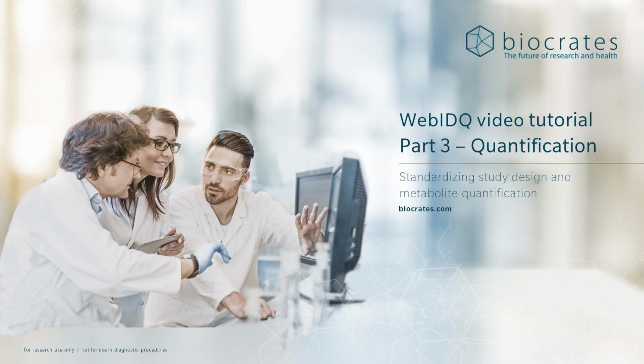In this video, we'll be discussing how to quantify and evaluate data after running a kit on the MS instrument. Quantification of kit data is performed directly inside WebIDQ. All MS data is uploaded, converted, and stored in the WebIDQ database. Once stored, data can be directly loaded to check peak integration or re-evaluate it at a later time.